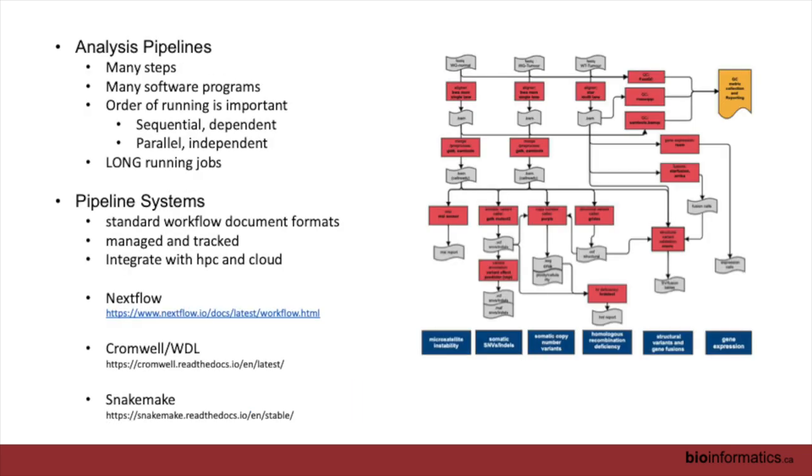And that brings us to the analysis pipeline. So we're going to run tools on the command line, and look at how we go from raw sequence to aligned sequence. But the reality is we don't have people doing that here. We are writing routines, we're writing pipelines, so we can launch these things from beginning to end without human intervention. A lot of monitoring, making sure things are running properly, a lot of dealing with failures or issues that might come up. But in no way is somebody sitting here and doing each of these things day by day as we run through it.